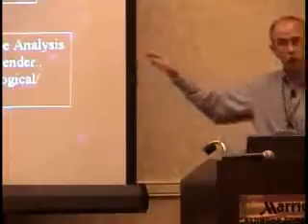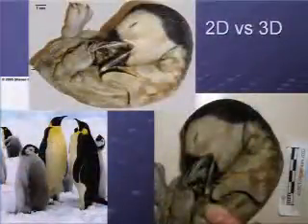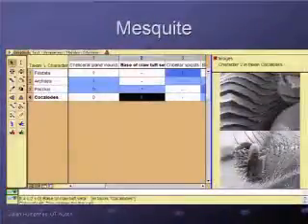And so the process of what's happening on this scientist's desktop is that he's looking at these features. He's looking at the features of the sunflower. He's looking at the features of a mouse or a goldfish, and looking for variation amongst the taxa in hand. And when he does that, he or she records those in a matrix.